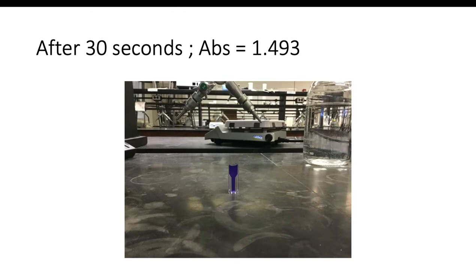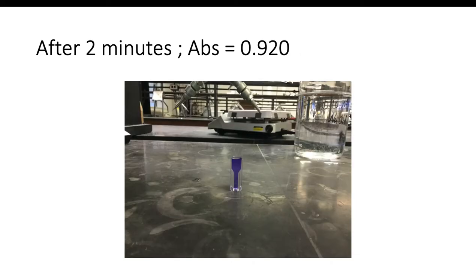As we'll talk about as I go through some of these images and some of our data, this absorbance is related to concentration. That'll be a big, important feature of a lot of what we'll be doing as we go through the calculations for this week's experiment, and really more the data workup that we'll be going through this week. But what I want to show here is just a progression of images, right?